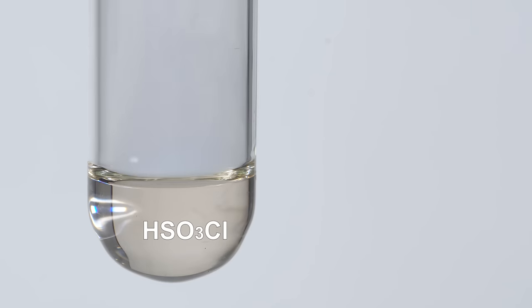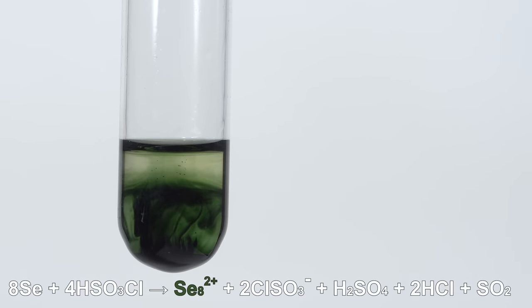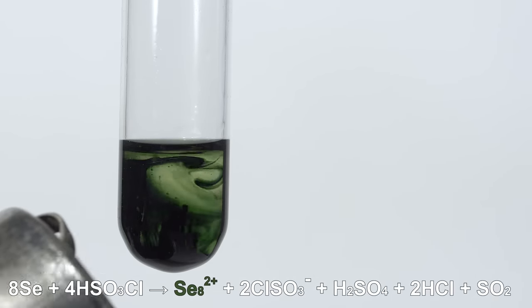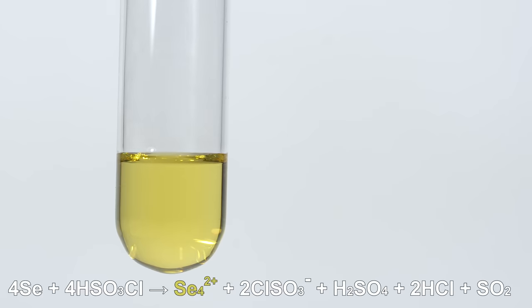Selenium dissolves in chlorosulfonic acid, giving a green solution, which after a few hours of heating turns yellow. The green color is due to the formation of the selenium-8 cation. The yellow color is due to the formation of the selenium-4 cation.